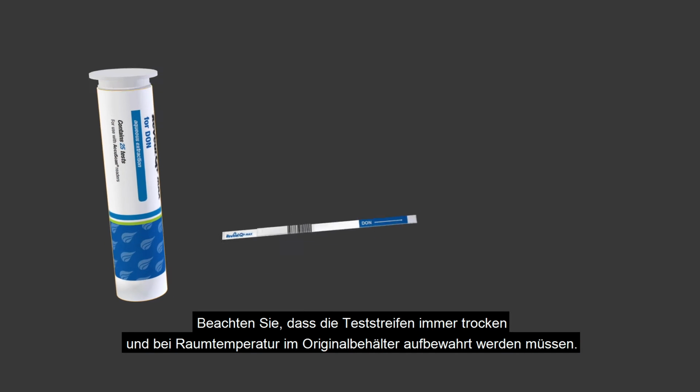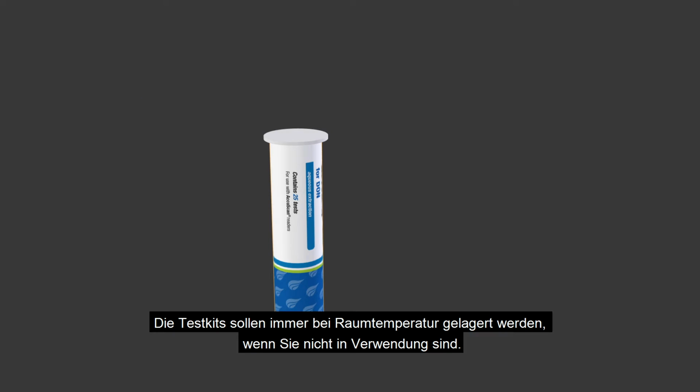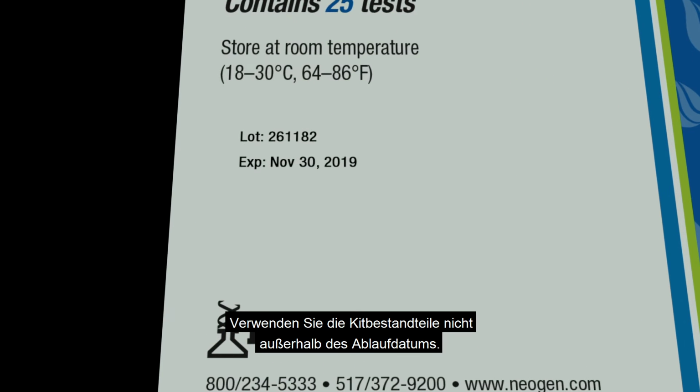Remember to always store the test strips in the stay-dry tube at room temperature. The kit should be stored at room temperature when not in use. Do not use kit components beyond the expiry date.